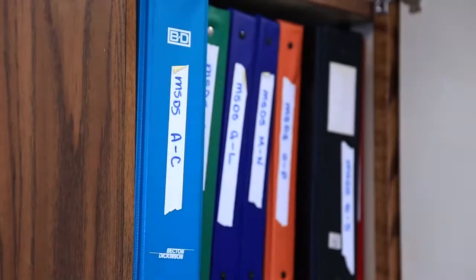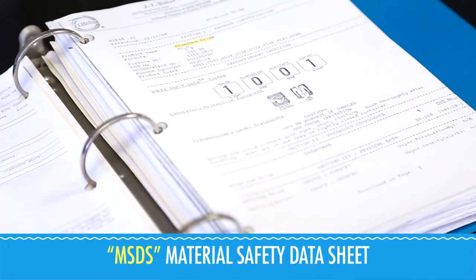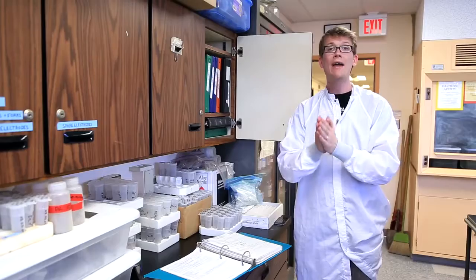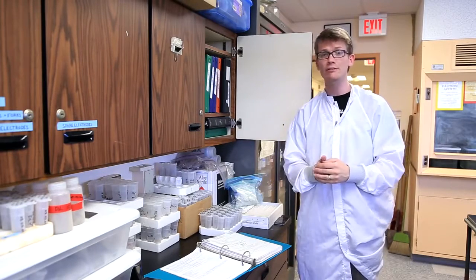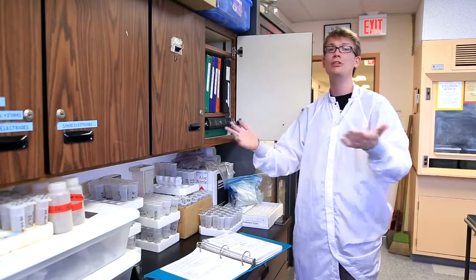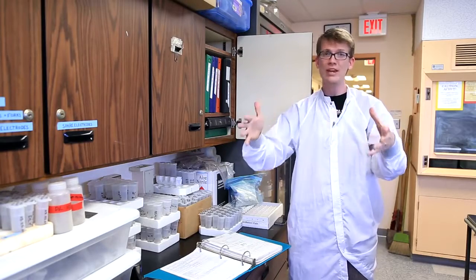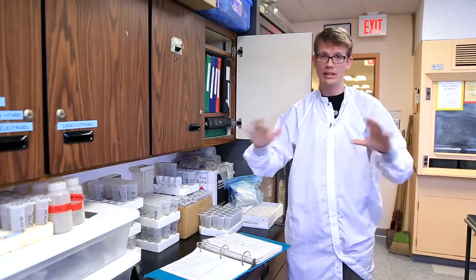If you ever need to know more about a chemical and what it might do to you or to the world, there's the good old MSDS, the Materials Safety Data Sheet. Every chemical has one, and it'll tell you all the terrible things that it might do to you. If you ever need to find one really fast, you don't need to go to the cabinet anymore. You can just Google MSDS HCl or whatever chemical you think is in the process of killing your friend. There will be information on how best to treat the person who got exposed. Of course, you should have always read the MSDS before you even touch a chemical. Also, you should probably assume that every liquid in a lab that is not water is flammable.